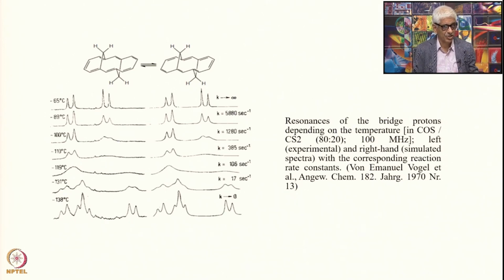There are conformational exchanges, domain motions, and these are microsecond time scale motions, millisecond time scale motions, nanosecond time scale motions. So in proteins you have all kinds of motions. These various kinds of motions will show up in your NMR spectra. How to extract that is an important point.